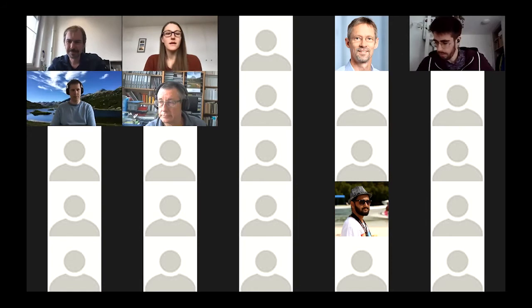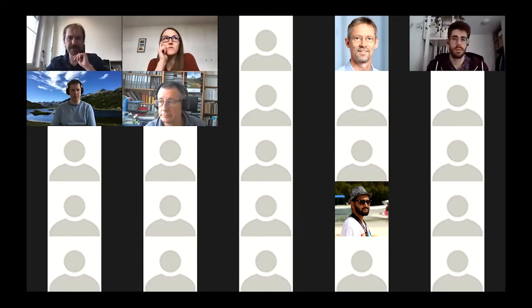Okay, I also have a question. In general, those maps are less precise than spot analysis, right? Let me show you something. Yes, every single pixel has very poor statistics.